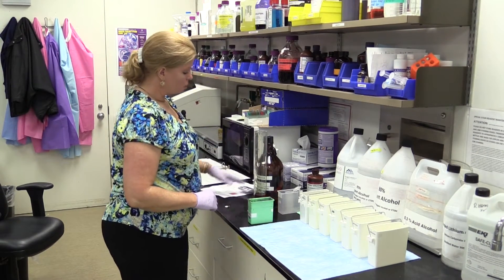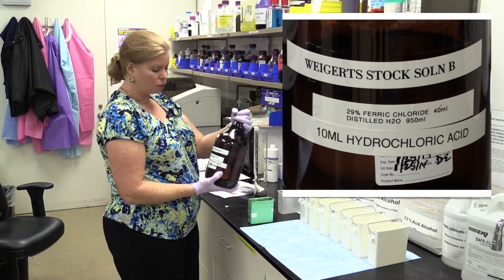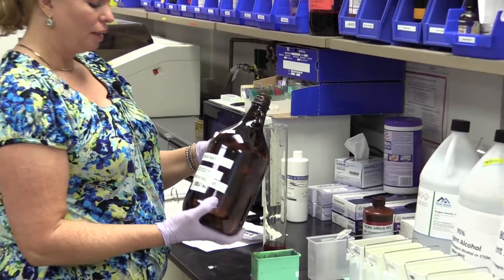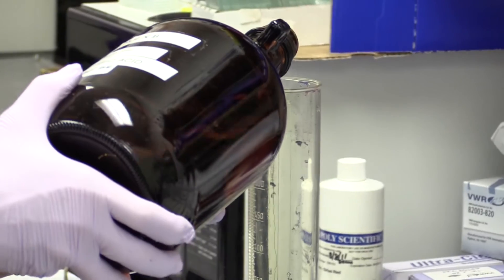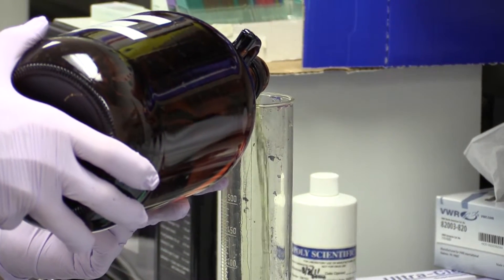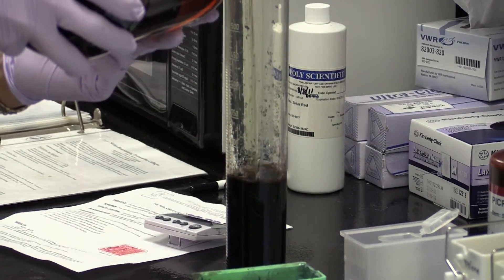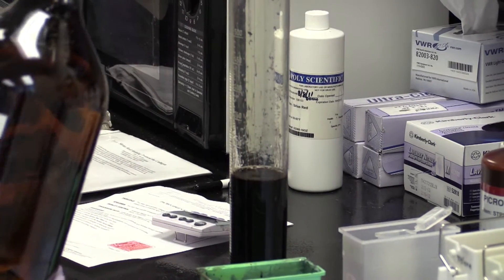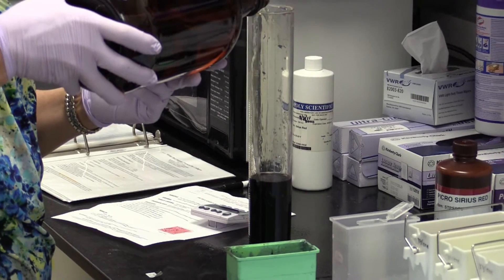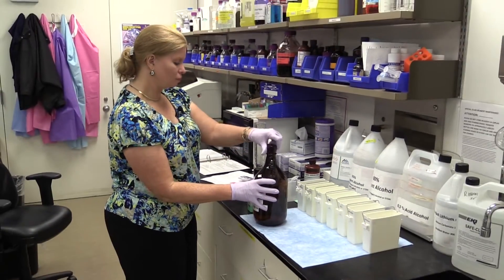Then I'm going to use my stock solution B, which is the actual ferric chloride. The ferric chloride is the iron metal mordant for this particular hematoxylin, and this is made in distilled water. It's a 29% ferric chloride, so I'm going to bring this up to 250 ml. You can see it turn dark right away when it's added to the hematoxylin.